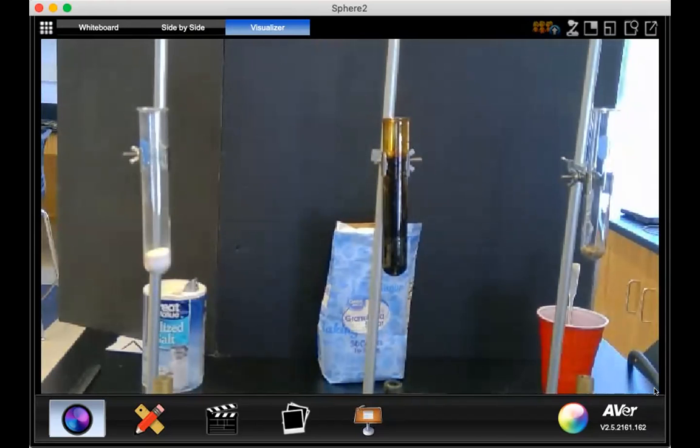So hopefully we can fill in our data tables from what we see there. Those observations. Again, for the salt, not much happened at all. The sugar, we got that. Now it's all kind of this black, crusty material that's left over. Okay, and then we saw the lead melted into that shiny silver material. Metal. All right, questions that you have about that?